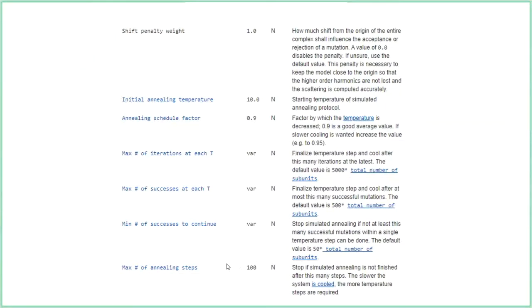You can either increase the number of annealing steps or decrease them to prevent overfitting. And there's a variety of such inputs there. Most people run with default values, but this is where input from people who have had experience before, like us, comes in. So you should talk to us when you're trying to use any of these programs, and we can guide you through them.